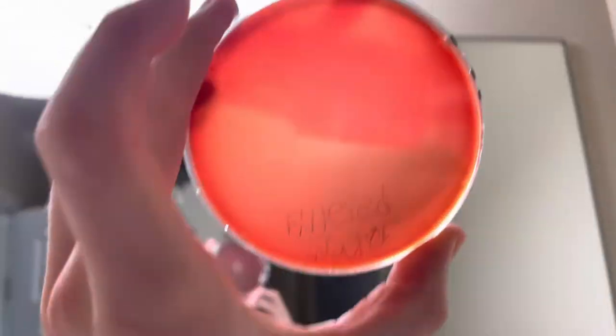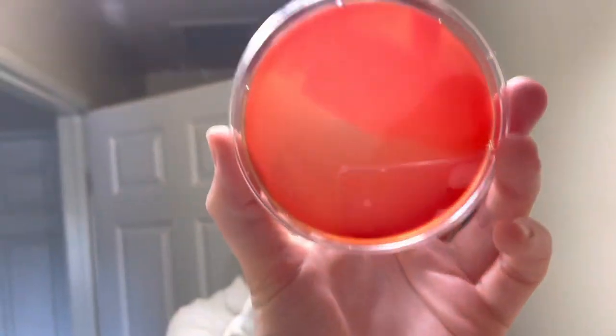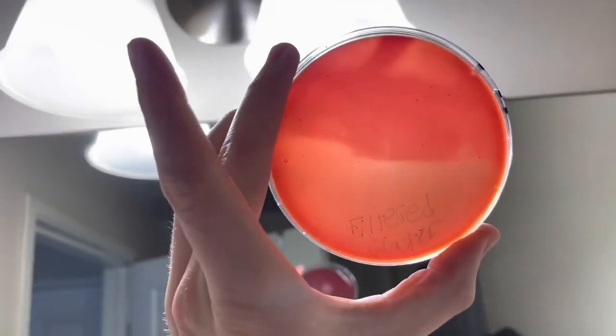This one's interesting, only because you can see a clear difference in color for the filtered water. I don't know if that means anything or not, but that one's just crazy to see. Anyways, that was the Brita filter, that was the filtered water.